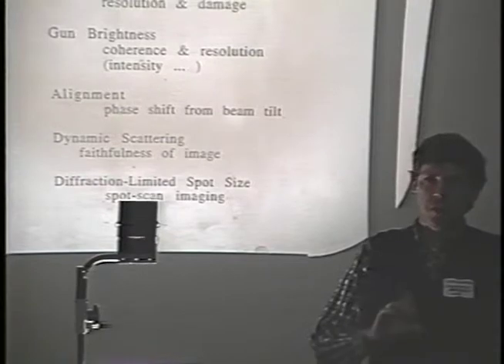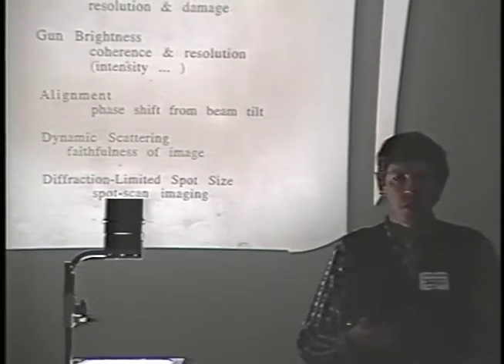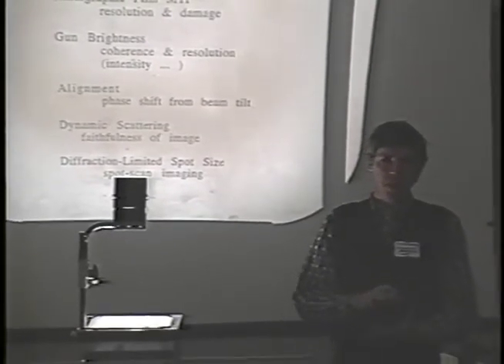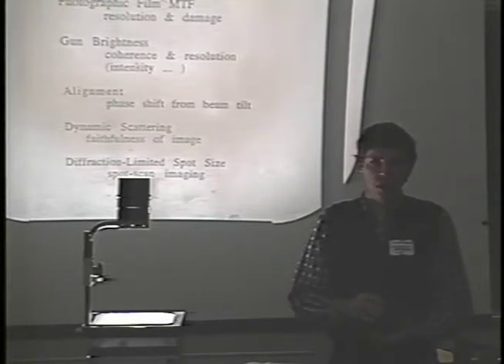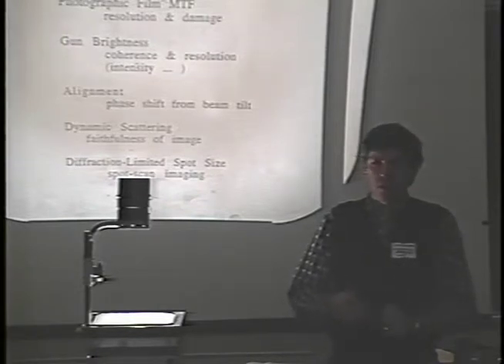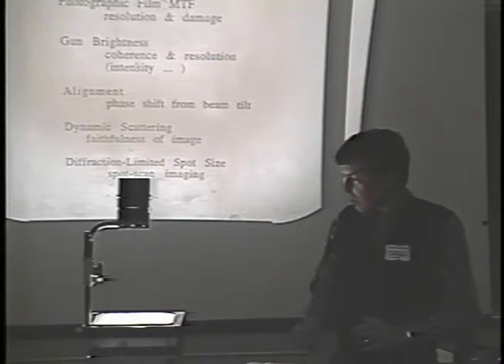A given thickness fluorescent screen, if it's optimized for 100 kV, will not be thick enough to absorb all the electrons at 400 kV, and so will not give as bright an image. If it's made thicker so that you use all the energy in the electron beam, turning that all into light, then the resolution may not be as good, because the resolution in general is fairly comparable to the screen thickness.